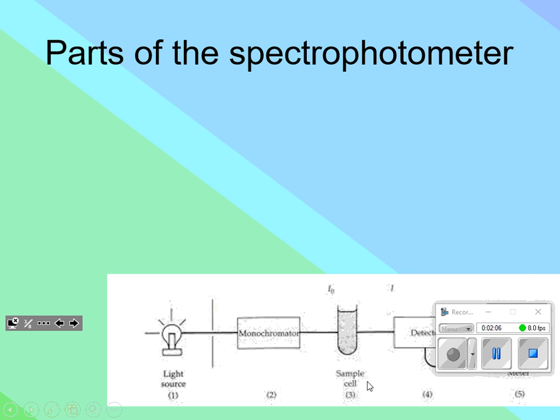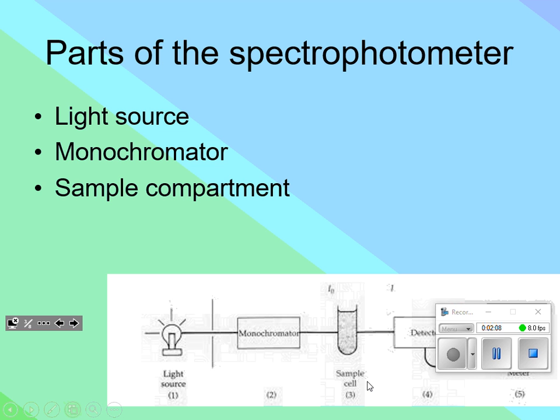The parts of the spectrophotometer, we have a very expensive light bulb in there. That light bulb needs to be warmed up for about 10 minutes before it can actually make good measurements. That's why prior to you sitting down, I asked you to turn on the spectrophotometers. That way when we are ready to go, we can just go with it. Next class, we'll probably start the day with doing stoichiometry review. Nothing in the lab has anything to do with stoichiometry. But that way we show up, we start stoich practice, and while we're practicing, we turn on the spectrophotometers, let it warm up for a little while.